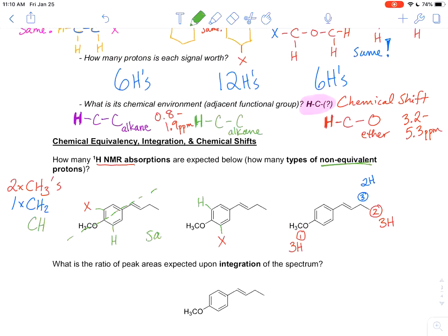So we find the same thing happening on either side because of the substitution of that ring. So these two, as drawn, if they're X's, are the same compound, which means that those two CH groups that are right next to that ether group are actually the same hydrogens, or rather they would account for one signal. So this would be our fourth signal, and this accounts for two hydrogens because we had two equivalent protons. So that's important. I want to make sure that's clear, that the two hydrogens that are next to that methoxy group are equivalent. This guy and this guy, these are equivalent protons.